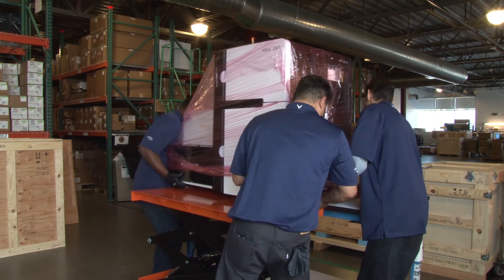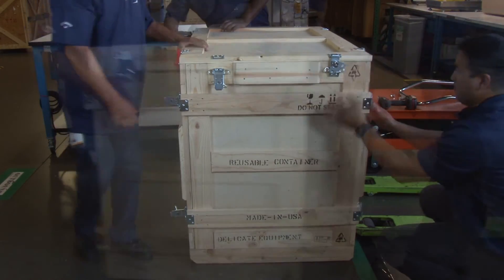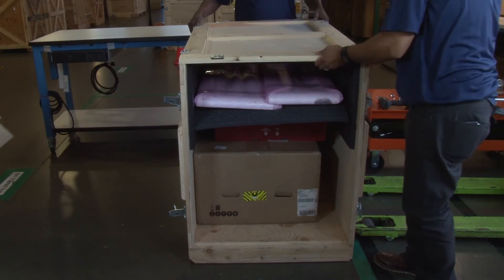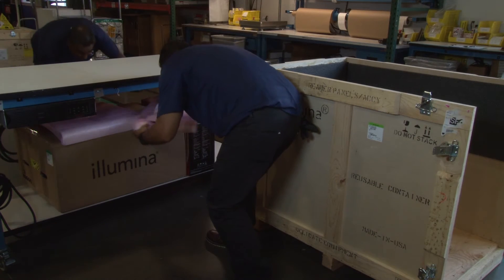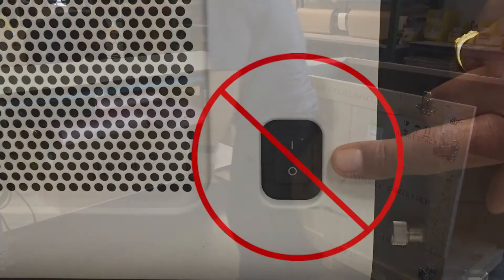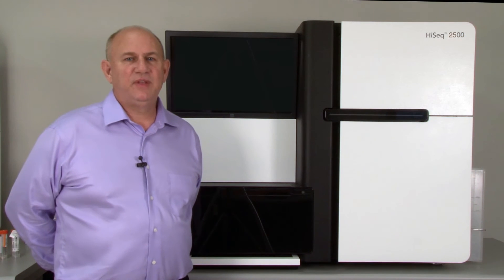Transfer the instrument to the customer's lab bench. Unlatch and unpack the accessories crate and place the items near the instrument. The delivery team is responsible for placing the instrument on the lab bench and removing debris. Please do not connect the power source or power on the instrument. The HiSeq instrument is now securely unpacked and ready for customer install.